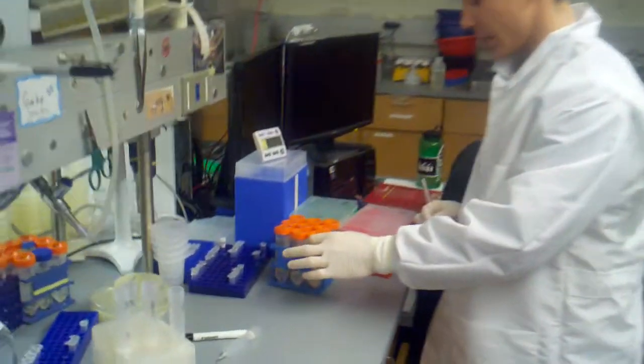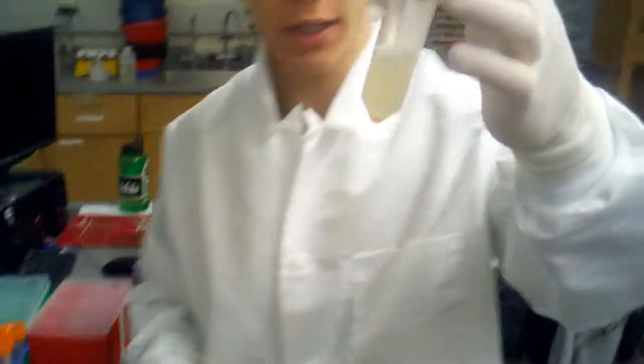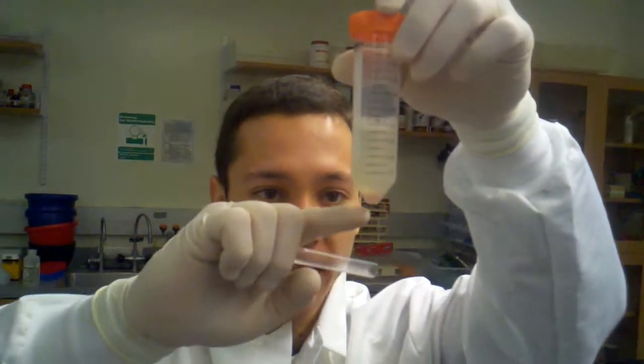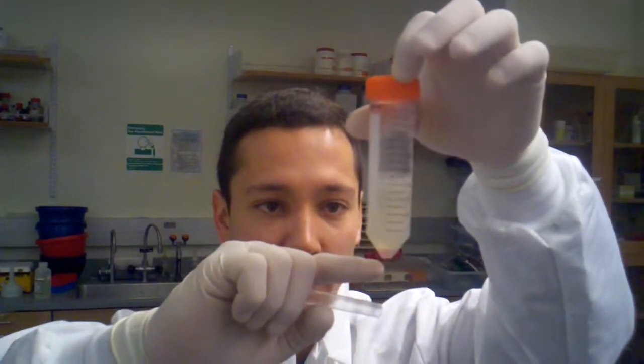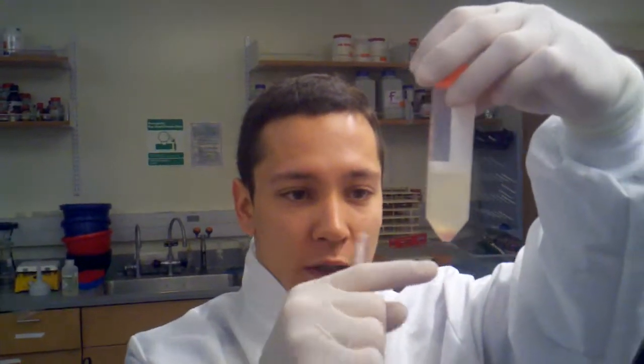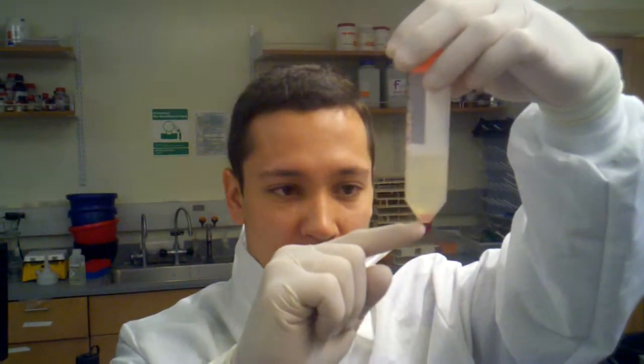Hi, so we're going to be finishing up our protein preparation. We have lysate that has been rocking overnight. You can see that we have our resin on the bottom, and hopefully all of our protein is stuck to that, and the rest of our lysate is in there. So we're going to collect that pink stuff that has all of our protein, and we're going to get our protein off of our beads.